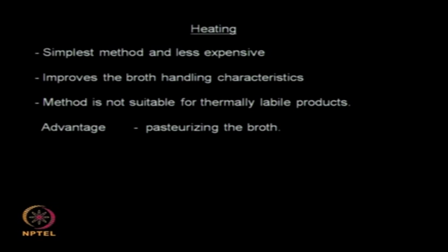That means the protein may lose its activity because of your heating, or you may have some metabolites which get denatured or deactivated because of your heating. And sometimes when you heat, you may also lead to certain chemical reactions, unfavorable chemical reactions. So you need to be sure that such things do not happen when you heat your material.